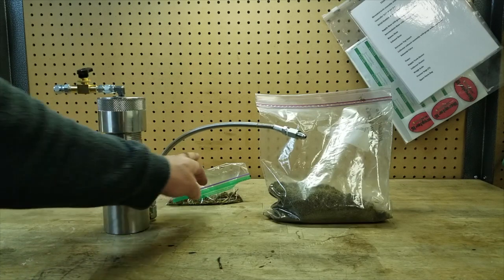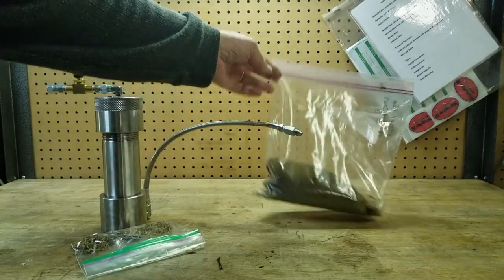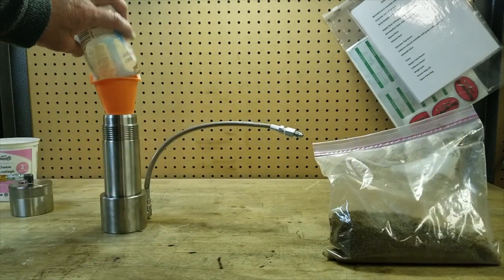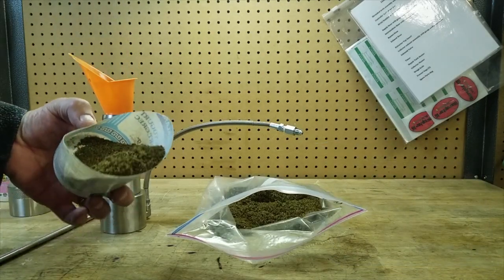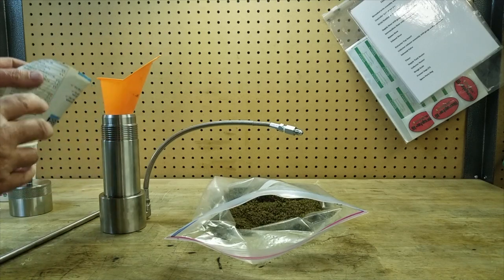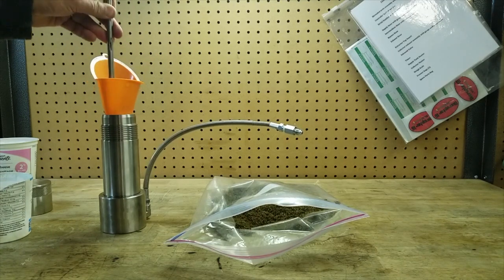We have some roughage that we'll put in the bottom of the extractor to minimize caking, and we have our known moldy raw material. First, take the roughage and tamp it evenly into the bottom, then load the raw material. Note the consistency of this material — tamp and poke through to minimize any voids that could allow the CO2 to channel.